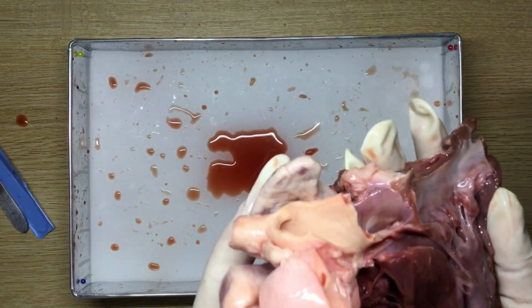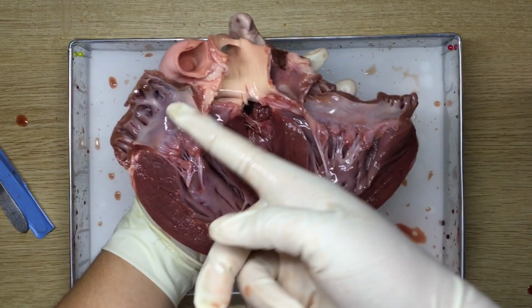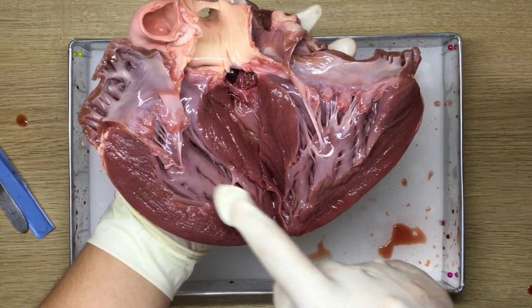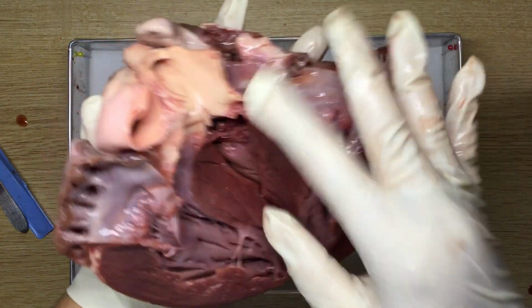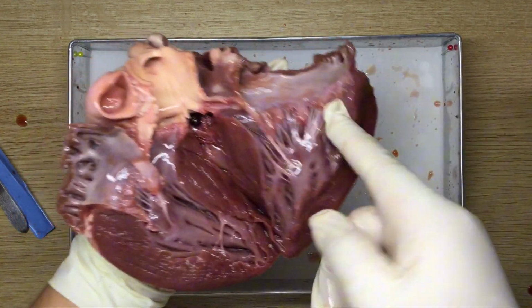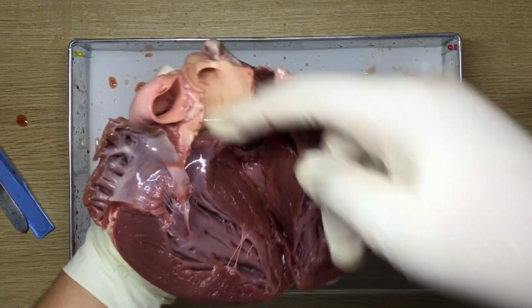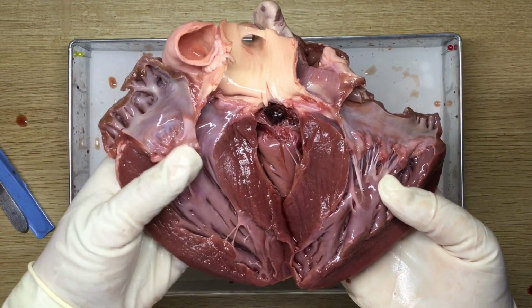The left ventricle is the thickest and most muscular chamber in the heart because it's going to pump blood to the entire body. We can see first the strings in the heart called chordae tendineae, which are attached to the papillary muscle and serve to pull the valve. The purpose of the bicuspid valve is to separate the left ventricle from the left atrium. The left ventricle connects nearly all organ systems through its function to pump oxygenated blood to the body. The left ventricle leads to the blood vessels, and there's a tissue that separates the left ventricle from the aorta, and that's the aortic semilunar valve.